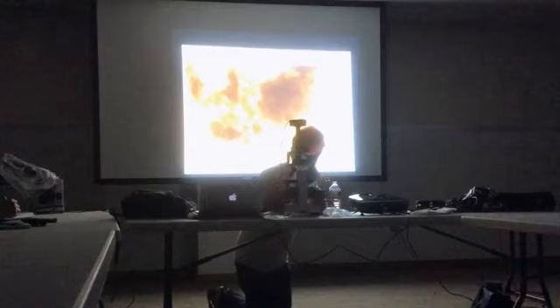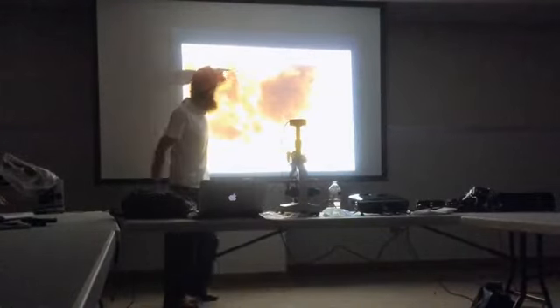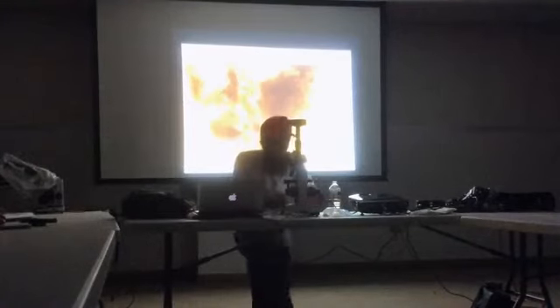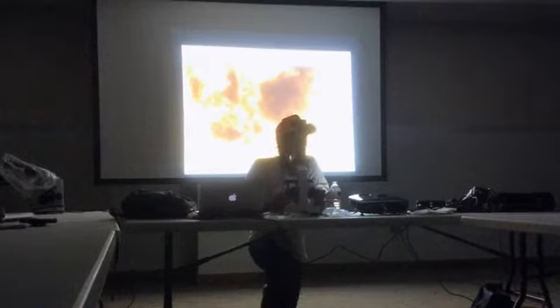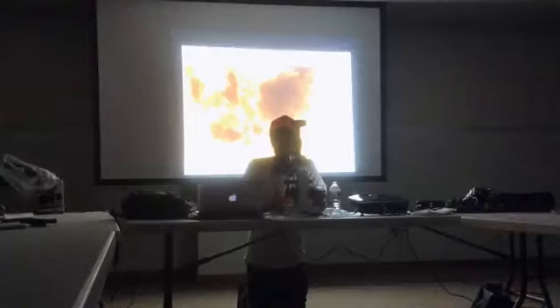Okay, so can you see that thing up at the top? What is that? Leg. No, it's fungus. This thing that's twisted right here? No, it's twisting. Flagella. So you can see how I zoom through it and you can see how it twists. So you see that it's not a fungus because it's twisting like that. So I know it's not. What that is most likely is some sort of plant material, some sort of fiber, or some other deal in there.